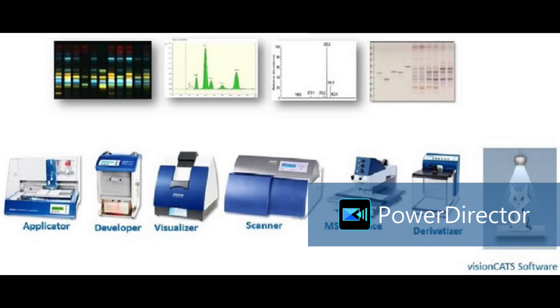In trace analysis, sample preparation and sample matrix play a vital role. So why am I talking about all these things? Because HPTLC is a very fast, rapid, cost-effective technique, and we can load any sample matrix, complex or simple, on an HPTLC plate, because it is visual chromatography. After sample application on a TLC or HPTLC plate, we can see what exactly is happening, how separation is going on our plate during the chromatographic analysis.